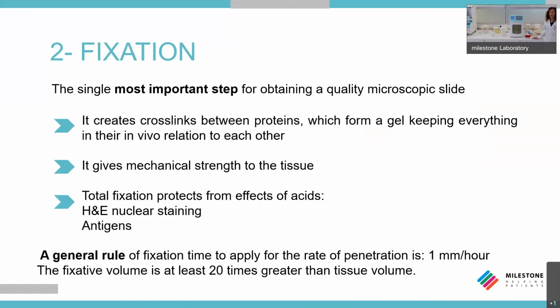The fixation stops the autolysis, the bacterial decomposition, the loss and diffusion of soluble substances. You know, fixation is the most important first step of tissue processing. Tissues that are not properly fixed can give bad morphology and processing artifacts.